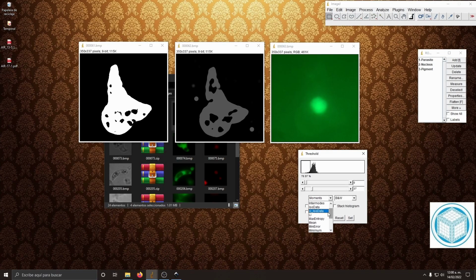Thresholds can be set manually, but there are actually a lot of automatic thresholding algorithms. Most are based on properties of the image histogram, but others use different approaches like calculating the mean intensity and standard deviation, and then defining mathematically a threshold from there, or by iteratively clustering an image into two classes, foreground and background, until certain parameter in the resulting image remains constant, for example. We are not going to delve into this because I'm going to use the one that works better. And for our needs right now, that means the one that makes the prettiest dots.